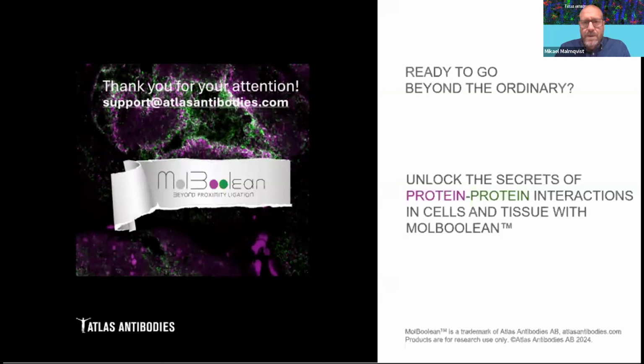Will MolBoolean be able to determine if it's an interaction or mere colocalization? I think it's the same there. We will always detect colocalization. We have a distance threshold. The oligonucleotide part is maybe 10 to 20 nanometers, so it's more or less in the same range as antibody-based FRET. But it's always colocalization. There is no method that looks at interactions, not in situ.